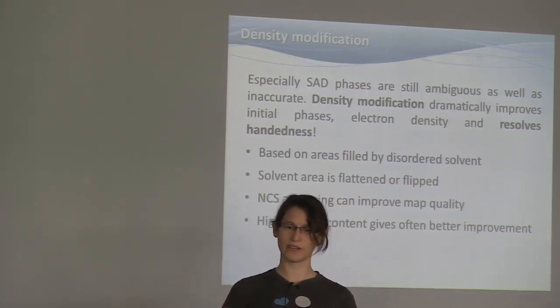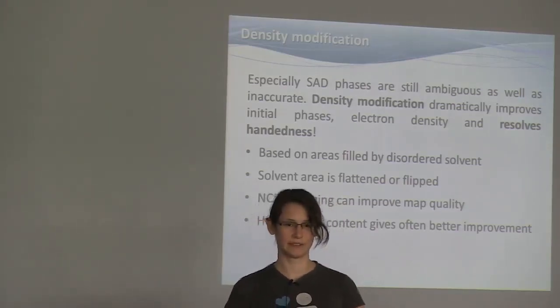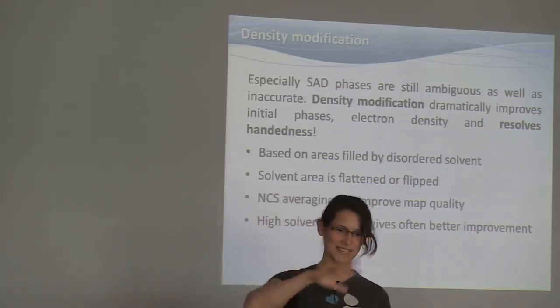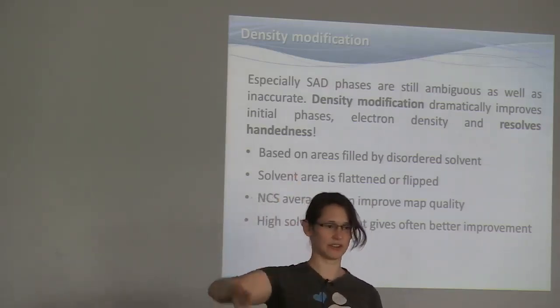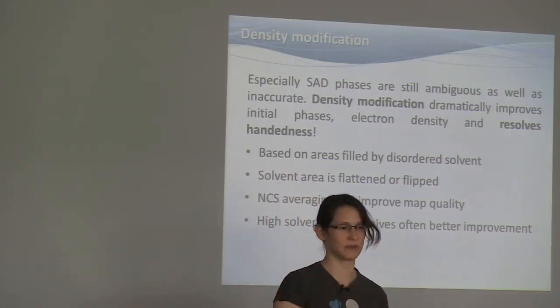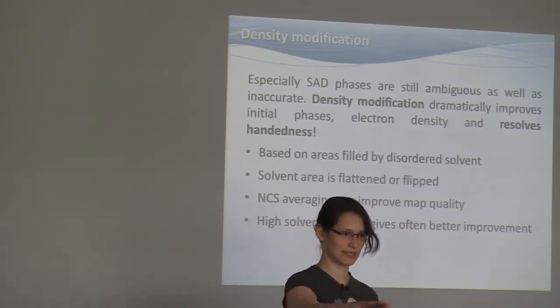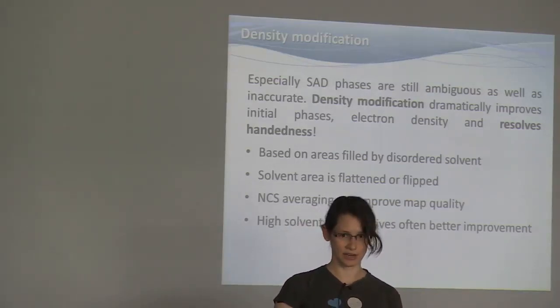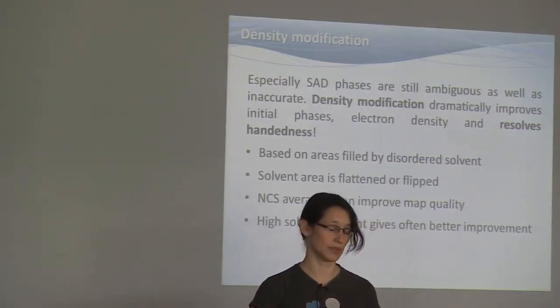No, the disordered region has a weaker signal. So that's what I'm saying. Yeah, exactly. The protein has peaks and troughs in its electron density because the atoms are repeated always at the same position. The disordered solvent is pretty disordered, and hence the electron density is flat. Or we like to say it's flat.